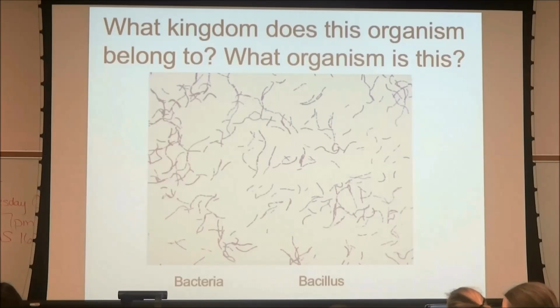Okay, so we've now looked at all 3 bacterial shapes. Make sure you guys can distinguish between the 3, okay? And make sure you know the technical names for the bacterial shapes. Okay?